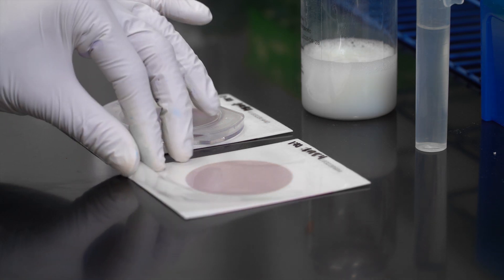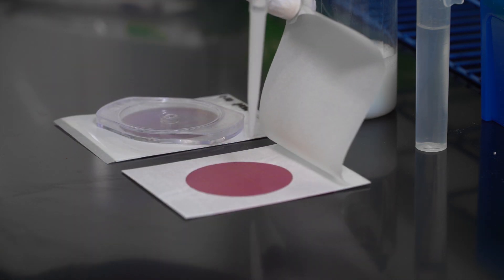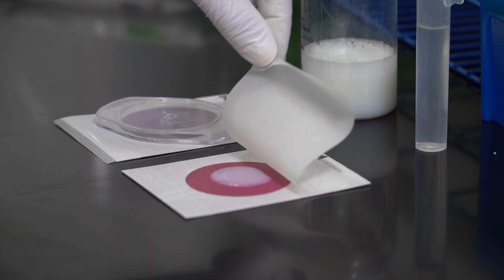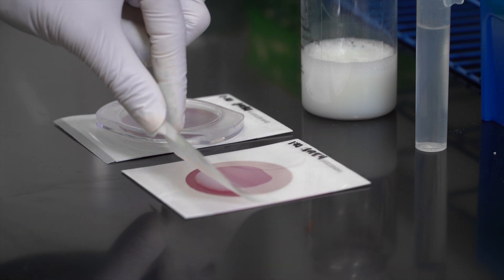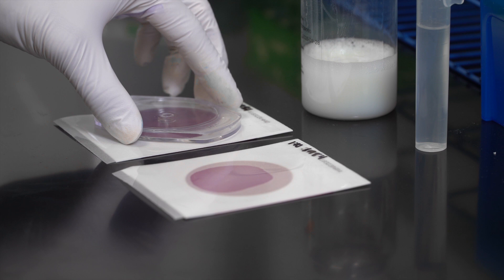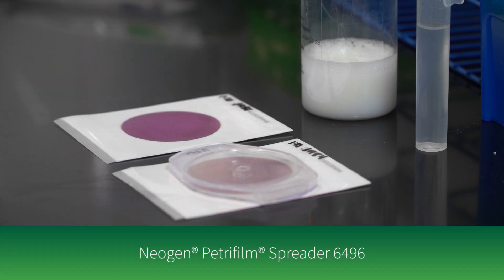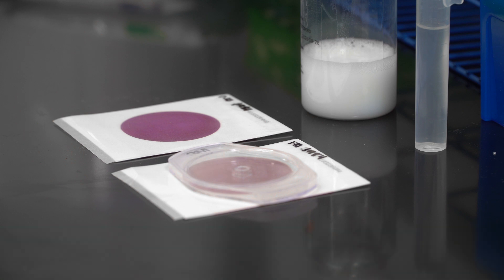To inoculate, lift the top film and dispense one milliliter of the prepared sample onto the center of the bottom film. Roll down the top film and place the Neogen Petri Foam spreader with the flat side down over the sample. Press gently to distribute the sample evenly.